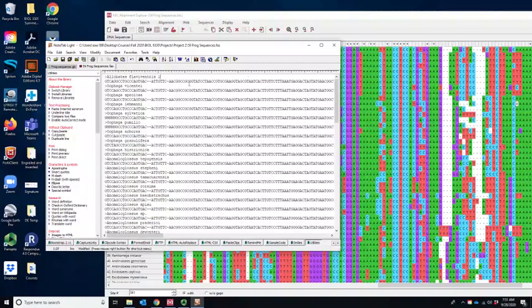But for our purposes, we're simply going to put name. Maybe on this first one, I'll leave the gene also, just so we can do it. We can save it. So FASTA is a more universal format. Pretty much all programs can open FASTA format. Some people call it FASTA format. And it's just simply a text document.